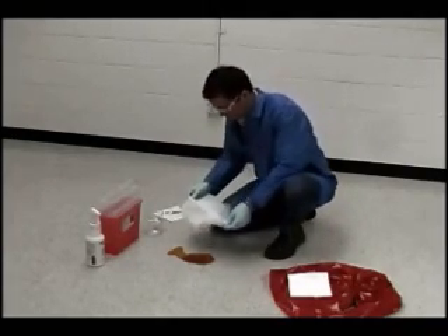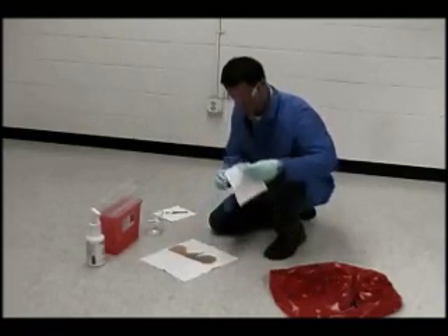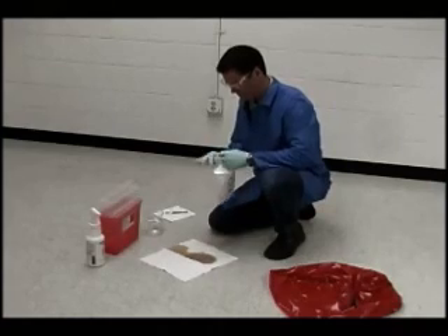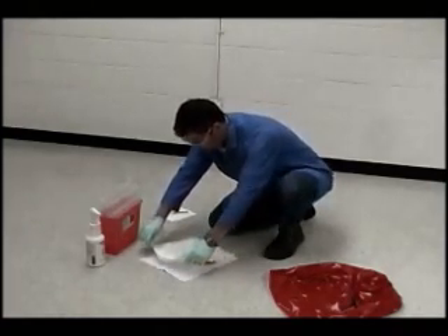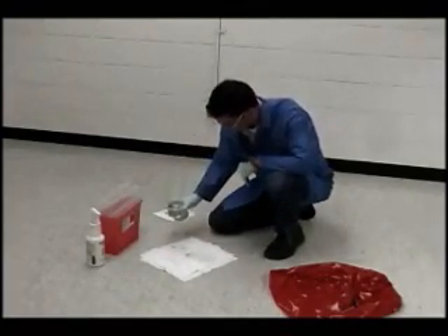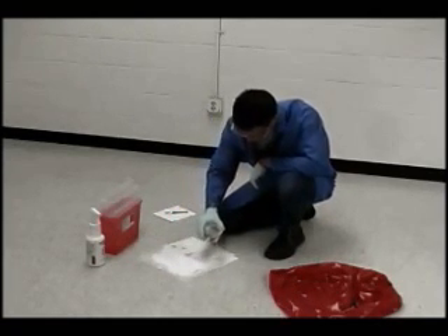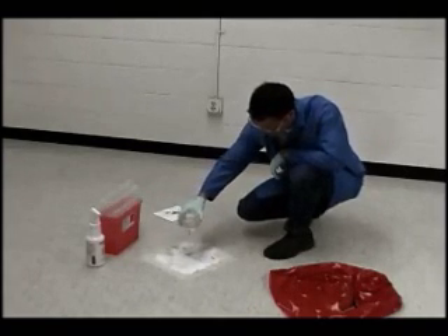Contain the spill by covering it with an absorbent material. This will prevent splashes and aerosolization when applying disinfectant. Carefully apply disinfectant solution on and around the blood spill, taking care not to splash during application.